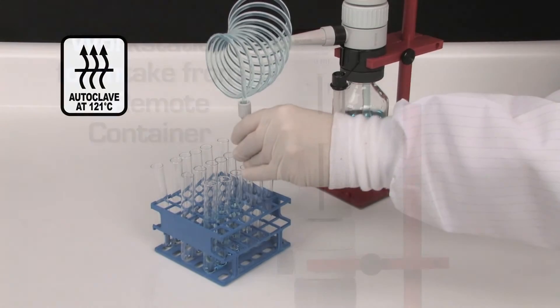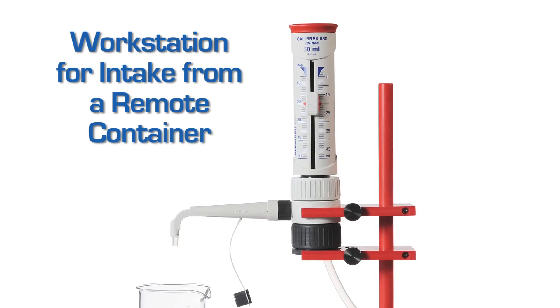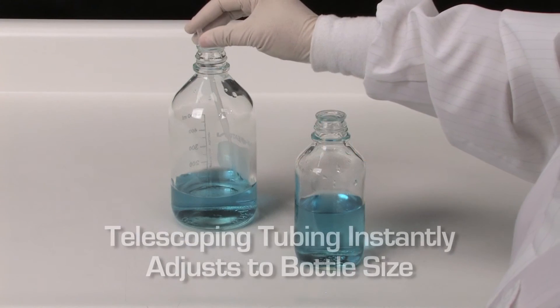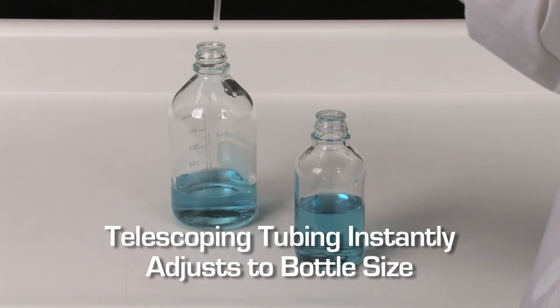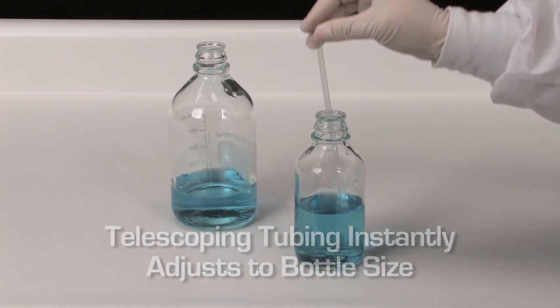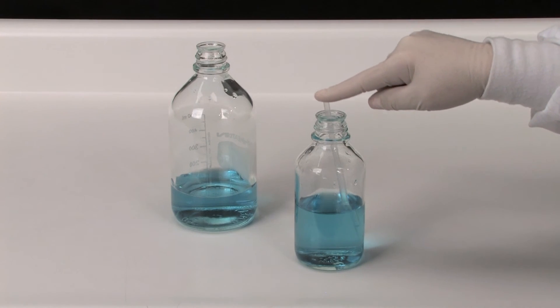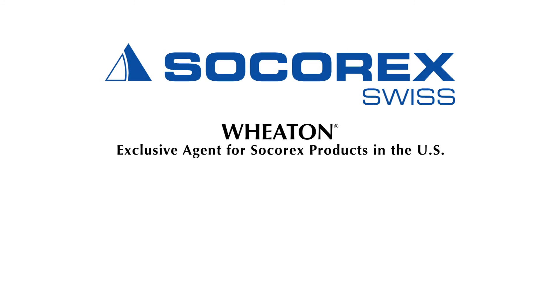If required, autoclaving is supported. The workstation facilitates liquid intake from a drum or other remote container. An optional telescopic tubing instantly adjusts to bottle size. Thank you for trusting Socorrex, your quality partner in precision liquid handling.